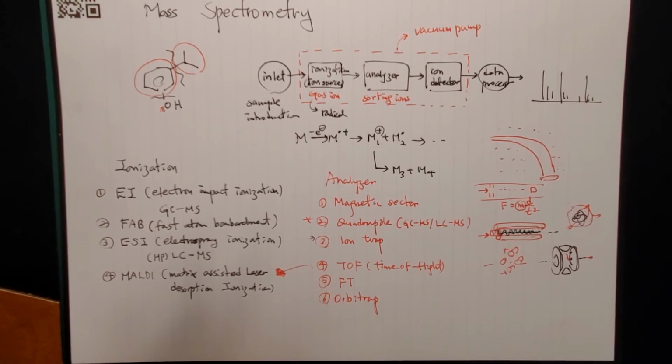And then mathematically, you can calculate the masses that you have in the trap. And for that, you needed a really high magnetic field, like, I forgot the exact number, but maybe 7 Tesla or something, very high magnetic field.